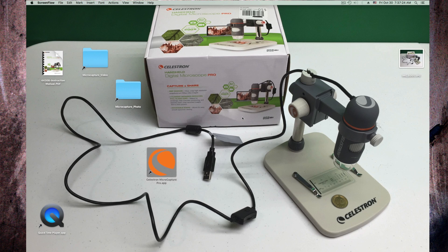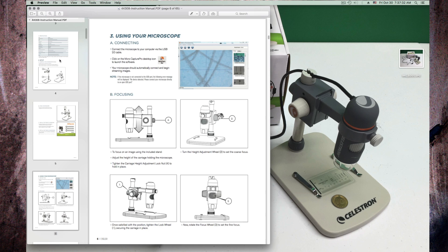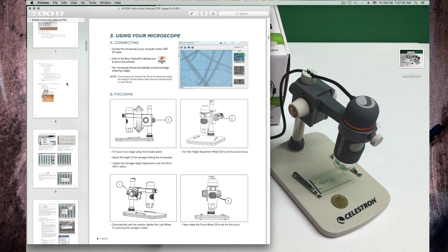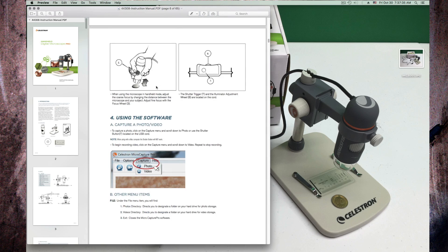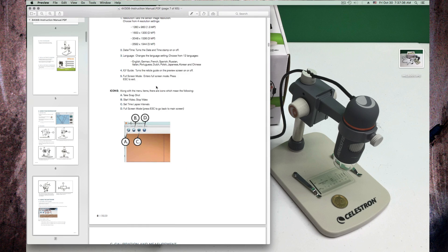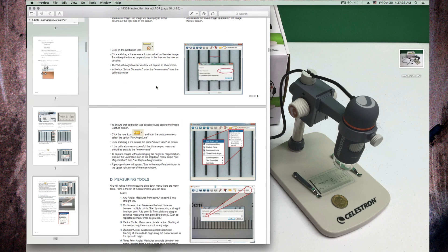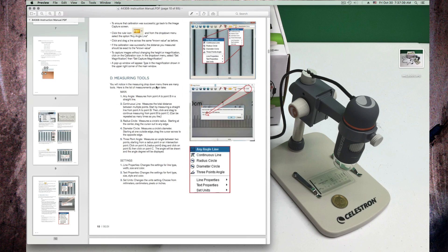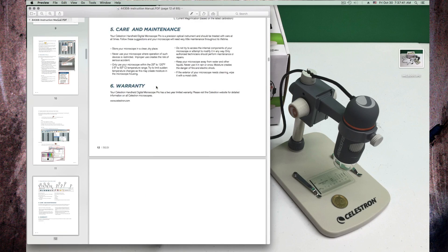Okay, I'm going to review this microscope as you can see here. It comes with the PDF manual here where they describe how to set it up and how to use it on Microsoft Windows.